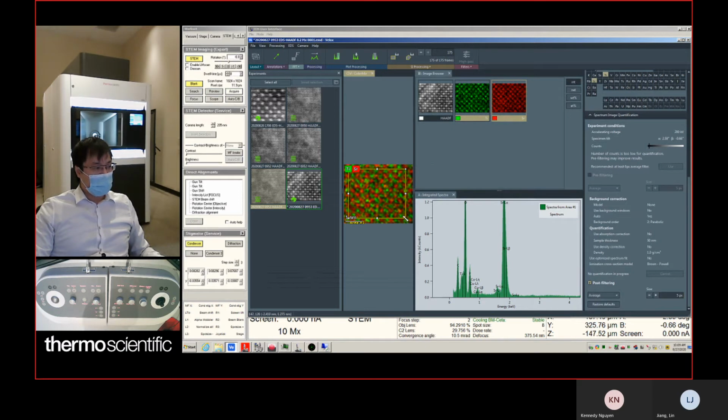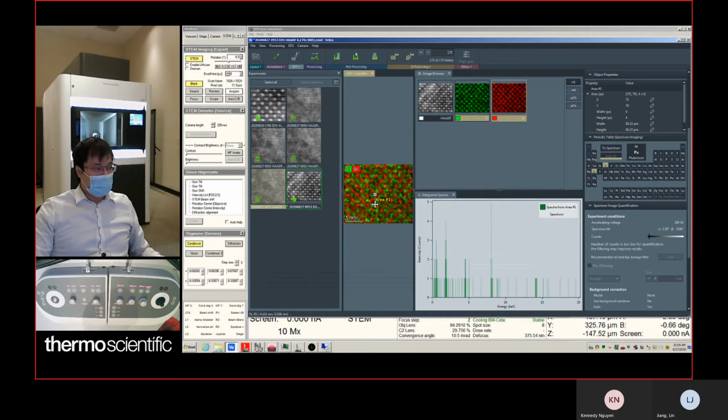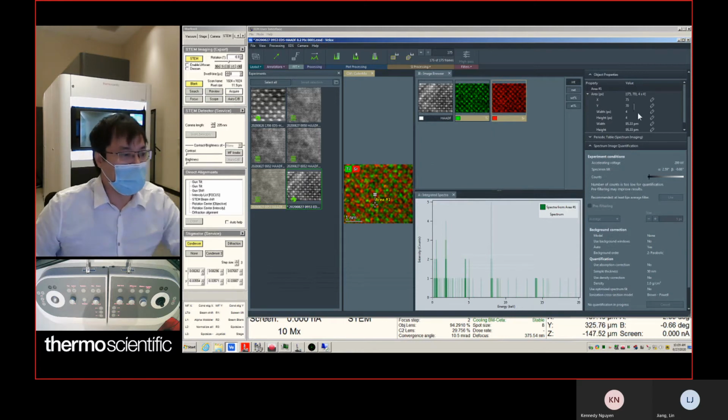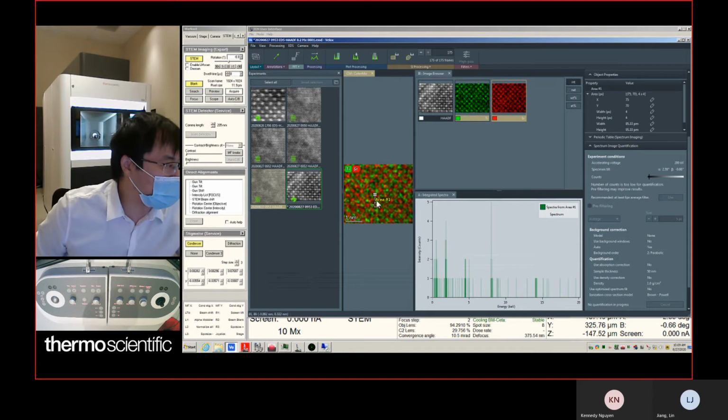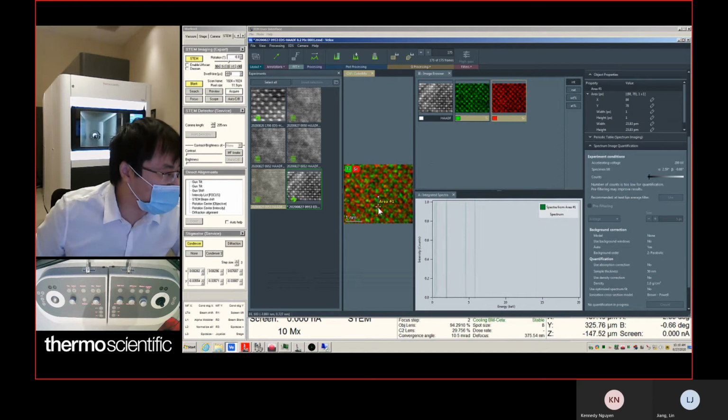And also you can use the master adjuster we just discussed during the presentation. You can select on by area, auto scale. You can select an area and pop this up. You can take a look at the size. When you select this, then scroll down. I can go 1 pixel by 1 pixel. So this is 1 pixel. Move around.